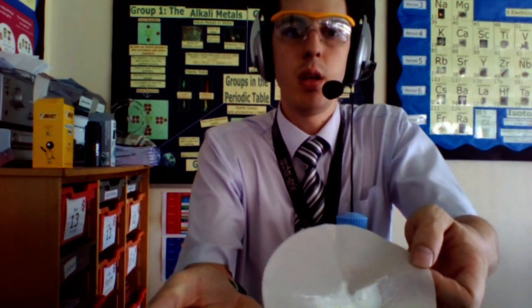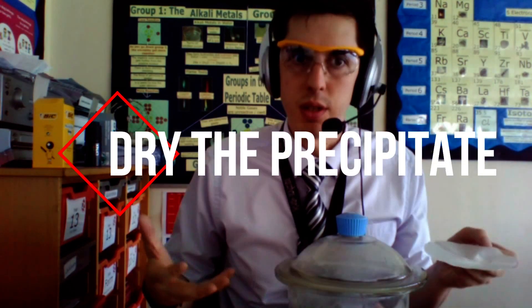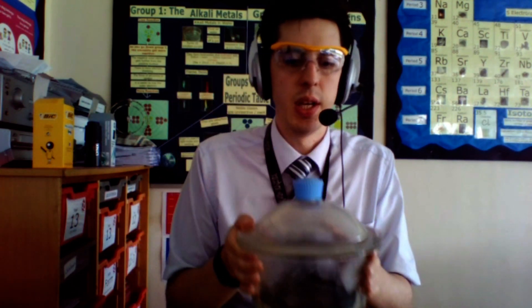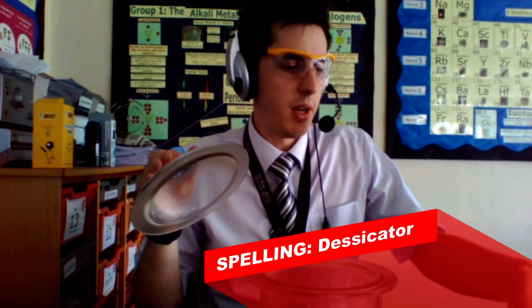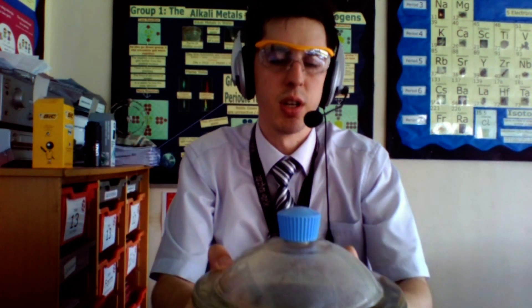Finally you've got your pure insoluble salt. What you need to do is leave it to dry. You can either do that by putting it into an oven or you can use something called a desiccator. What the desiccator does is it removes the moisture from the product. Take the lid off, put your sample in, lid back on and then the crystals underneath will help to remove the moisture and help it dry.